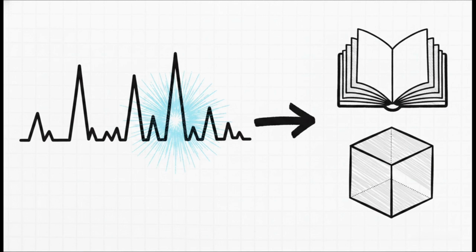Plus, the height or the intensity of the peak actually tells us about the relative amount of that specific phase or its orientation. And the best part? You don't have to calculate every single material from scratch. In the real world, scientists take this generated pattern and just cross-reference it against massive standard databases like the ICDD or JCPDS. If your pattern perfectly matches the database pattern for table salt, well, you've got table salt.